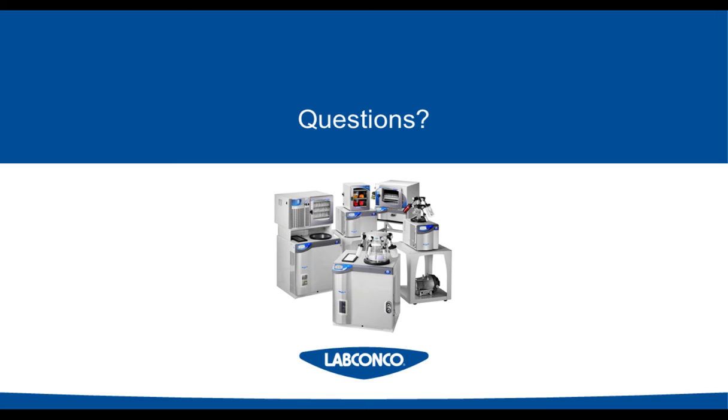First question is, at what temperature must the sample be cooled before lyophilization? Well, it really depends on what the... Sorry, Megan, go ahead. That's a really great question, but as Jenny was starting to say, it just depends on what the sample is made up of. So, we say that choosing a collector for a freeze dryer, you need to have the sample temperature differential between 15 and 20 degrees colder than the sample's freezing point.